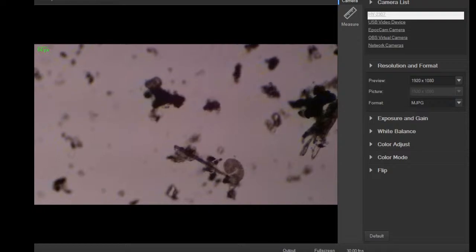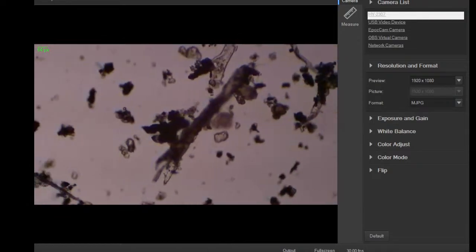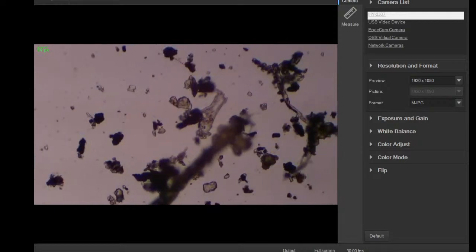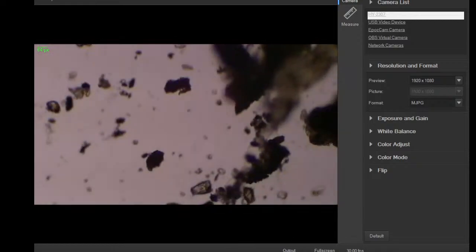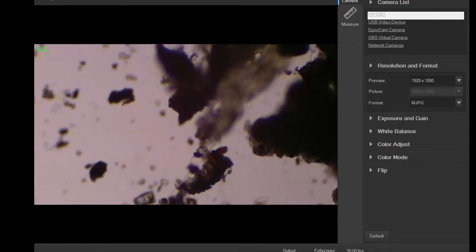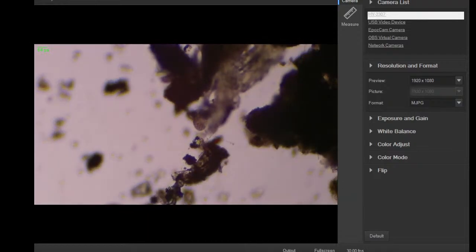I haven't figured out what group this is yet. Some of these are really hard to get down to genus. Sometimes you can get them to family or at least maybe order, but Paramecium's an easy one because it's so ubiquitous and it's kind of unmistakable, just like the typical amoeba, Amoeba proteus. But some of these other guys are really hard to figure out. Okay, he's taking a break, so let's zoom in, see what's what.